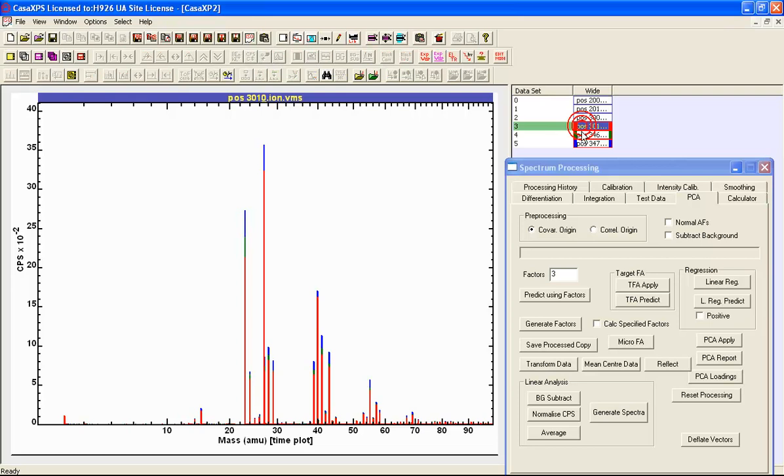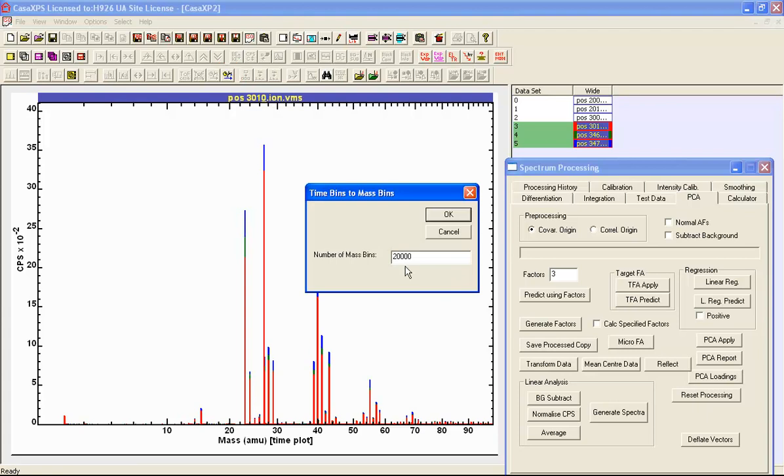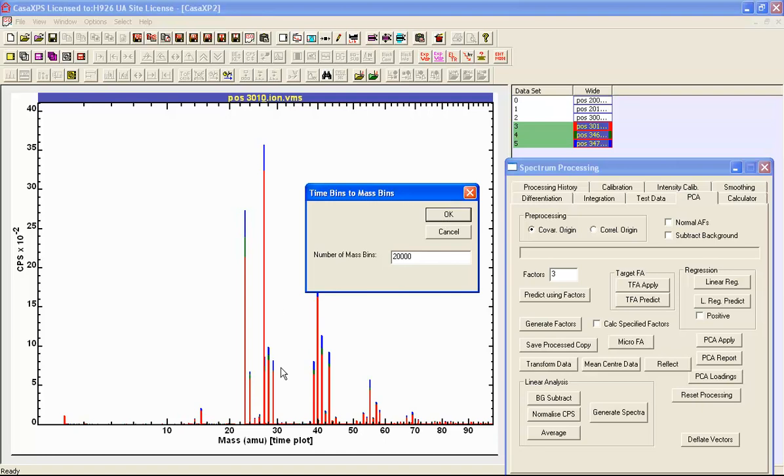So what I will do first is calibrate these using an option on the SIMS toolbar that will allow me to time to mass calibrate data. What I'm going to do is use a relatively small number of mass bins, and the reason I'm doing this is to help with the explanation of PCA. It will be much easier to display and explain the results of PCA if we don't have too many mass bins that we have to process in terms of display.